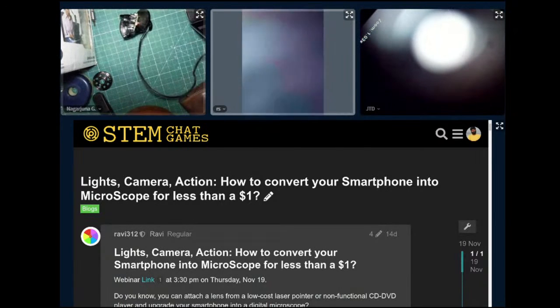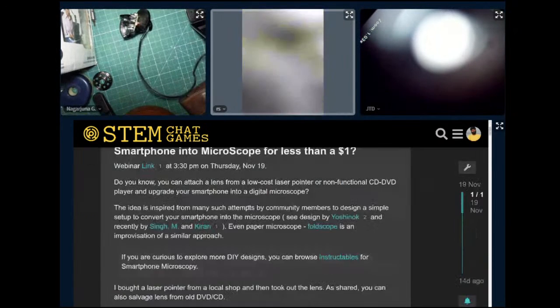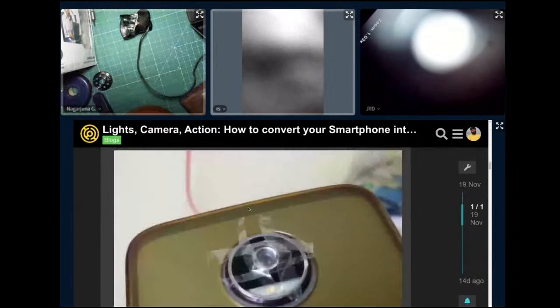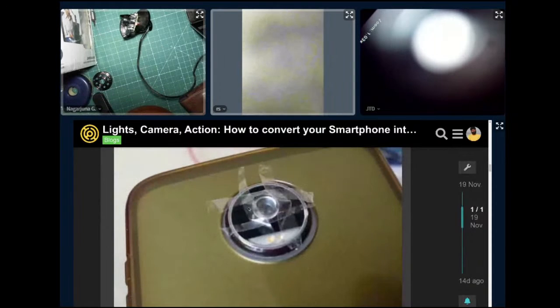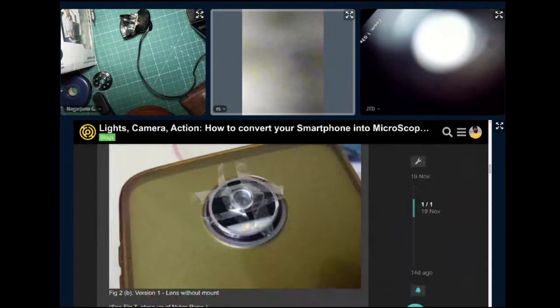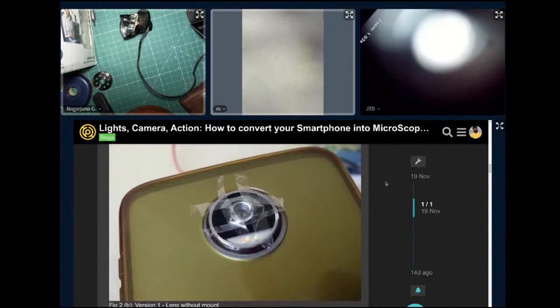Yeah, I was showing the fabric of my handkerchief using the laser one. Same, the laser one. This is a setup which I made. I think today we might not be able to cover the details of this, but I really want to take some time and discuss this and Foldscope maybe in the next session, just to show what is the possibility.